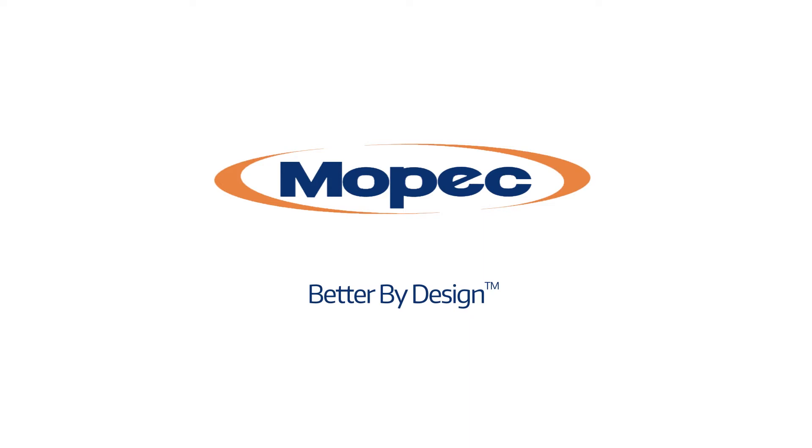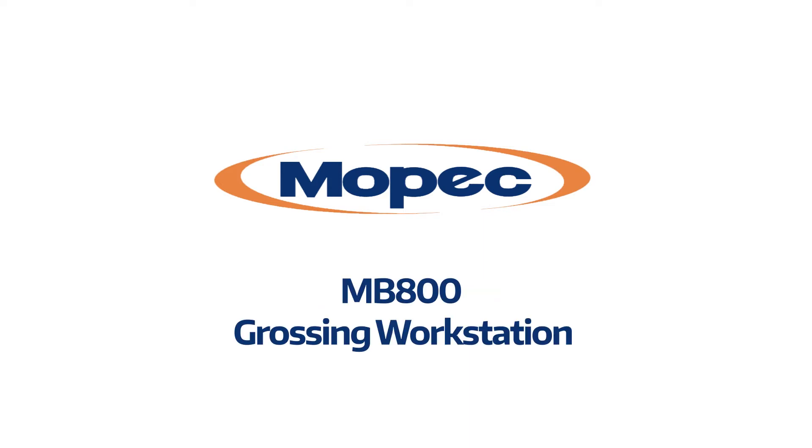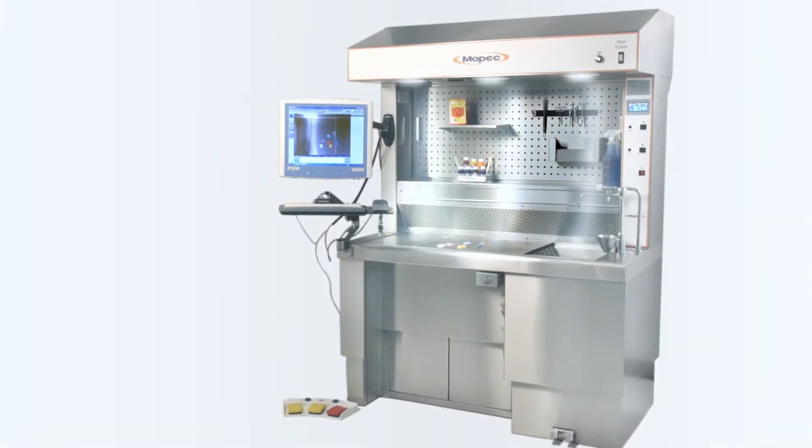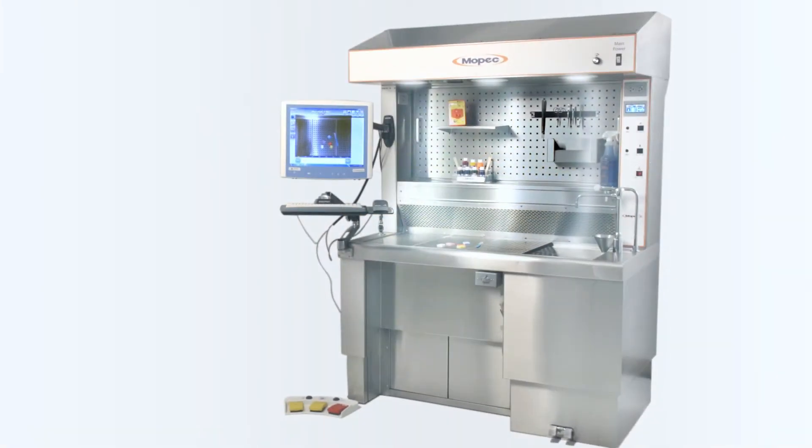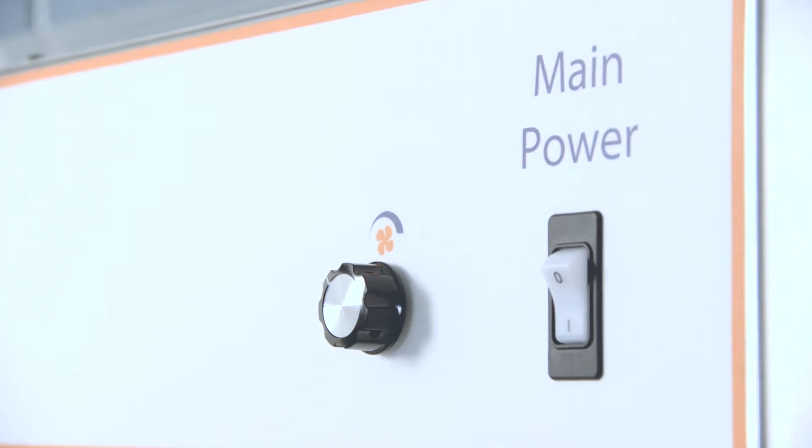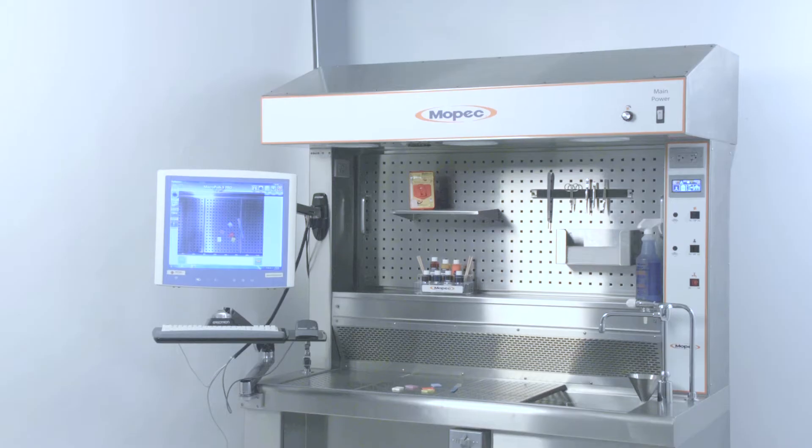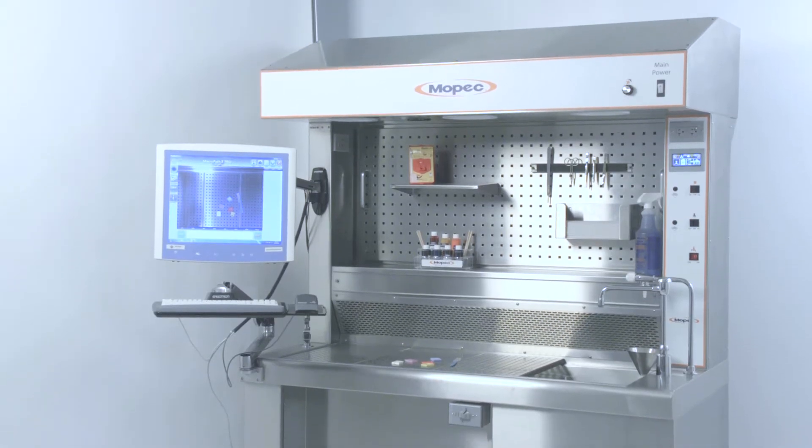Better by design, Mopec introduces the Mopec MB-800 grossing workstation. Merging over 20 years of experience developing safe, American-made pathology equipment with the latest technologies in the industry, Mopec introduces the MB-800.